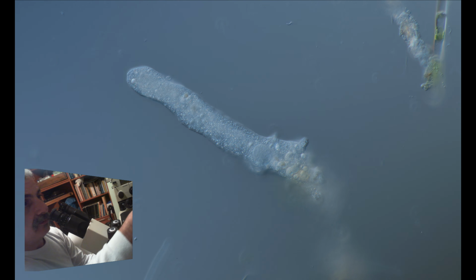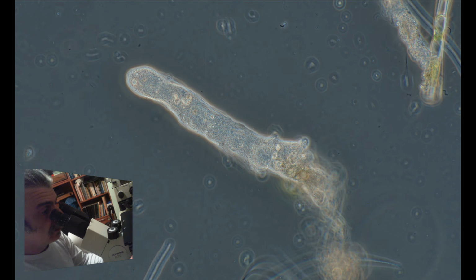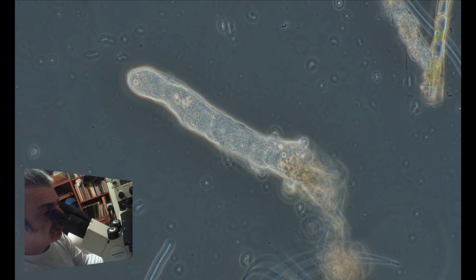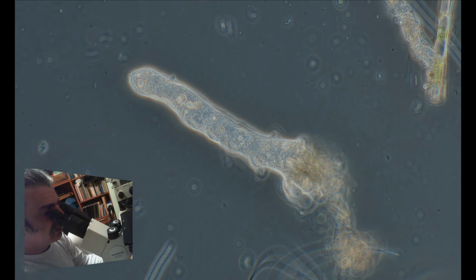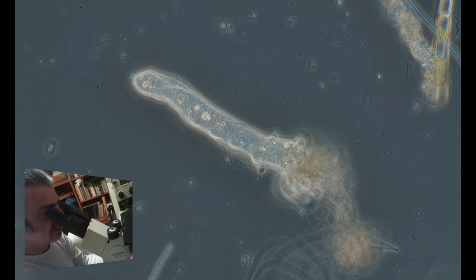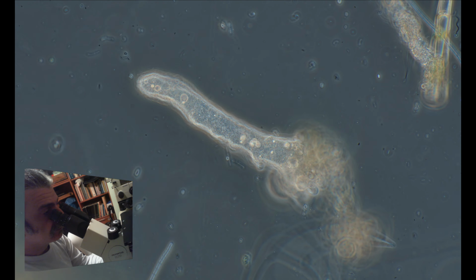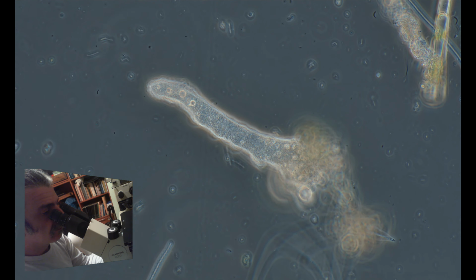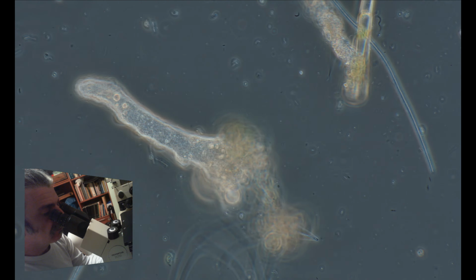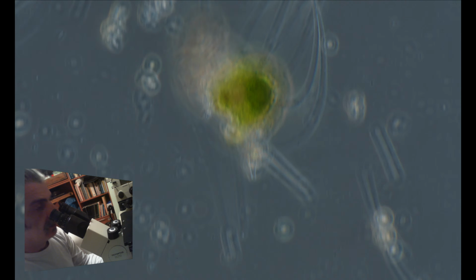Actually, if we move to a different illumination technique called phase contrast, we can see it even in greater detail. And you can see the nice flow of particles inside it. Okay, back to 10x.